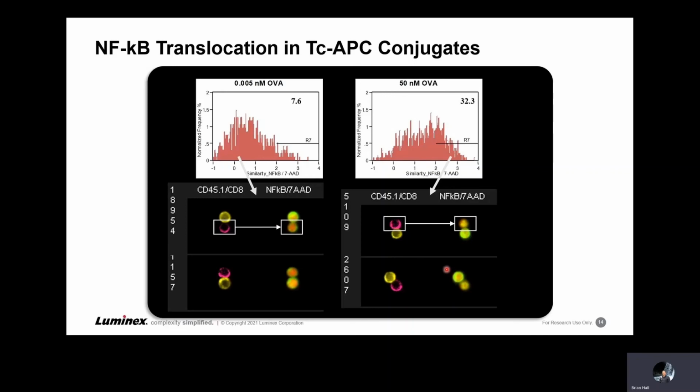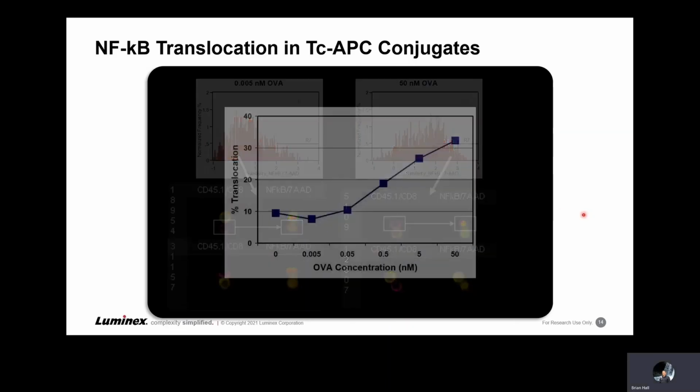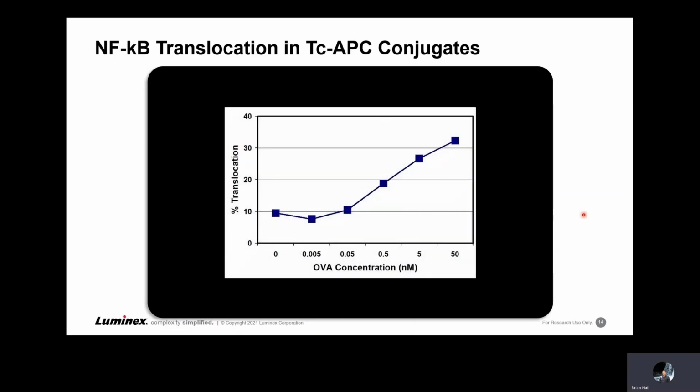So here, using this masking and different features, we're able to isolate the T cells in this single event and look at the spatial distribution of the transcription factor NF-kappa B. It's a really good use of imaging flow cytometry. Using the similarity feature, I can then calculate an EC50 curve. I can do a dose and a time course with that, and look at the temporal interactions of when NF-kappa B is translocating in these activated T cells.